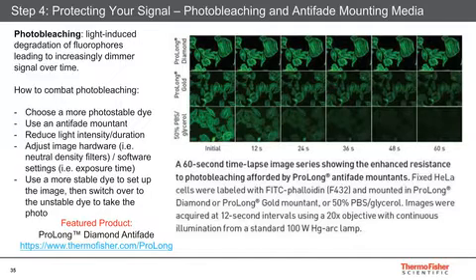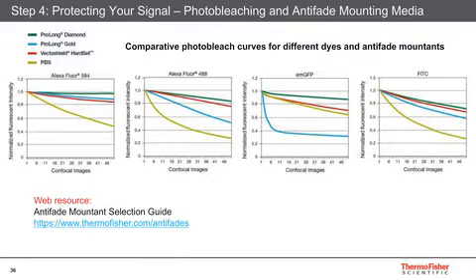Remember, your hardware settings play a role too. Exposure time: the longer your exposure time, the more photobleaching you'll get. For those who like data, here are some graphs that show photobleaching. These are normalized to their initial intensity, and you can see over time that the intensity decreases, as you see in the lines here.